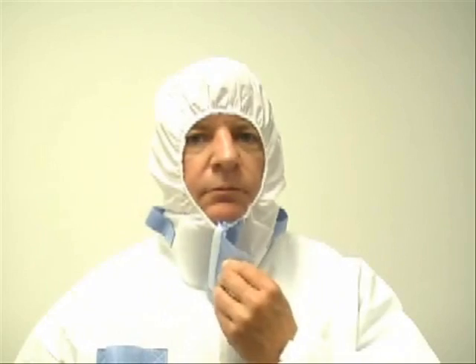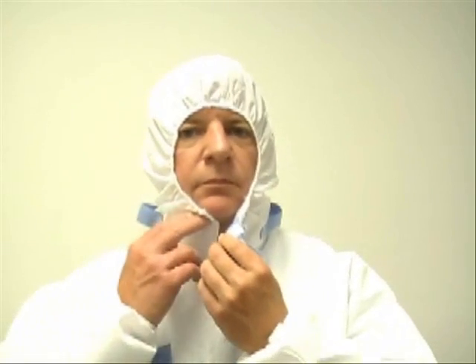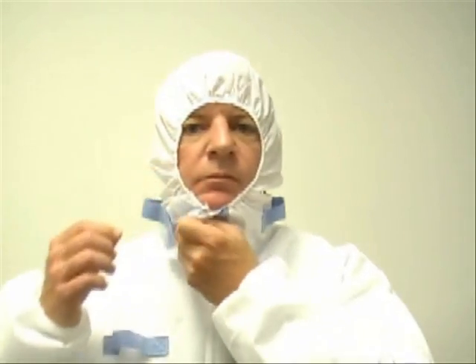The suit features an adjustable velcro flap around the neck closure to ensure a tight, custom fit when used with or without a respirator. This feature also minimizes the chance of exposure when doffing the suit by eliminating the need for a worker to touch the edge of the hood to release the zipper.